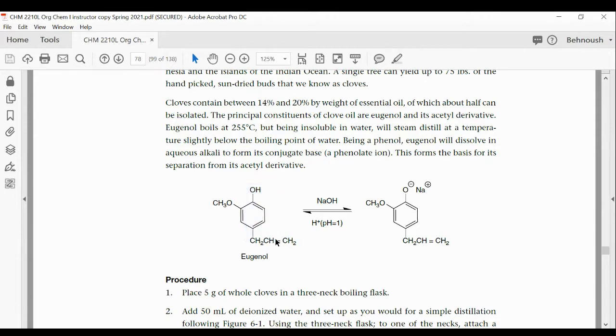Your data table is not just the mass of the product. You could also have the qualitative analysis, the permanganate or Baeyer's test color change as evidence, and the ferric chloride test and its evidence. Also, it can go in the data table, and it can appear in the abstract, conclusion, and discussion.